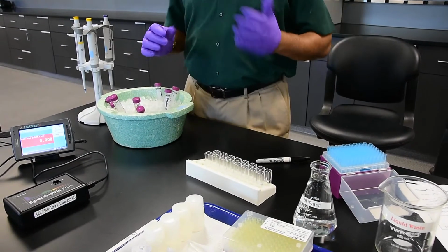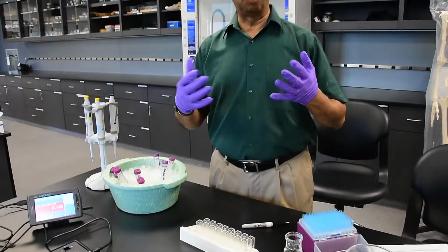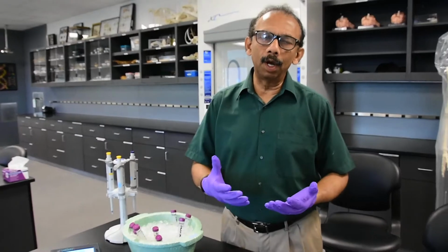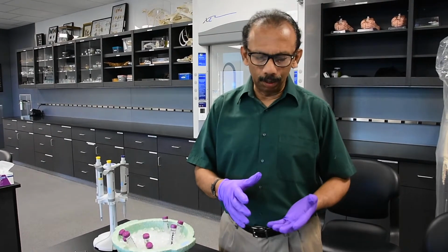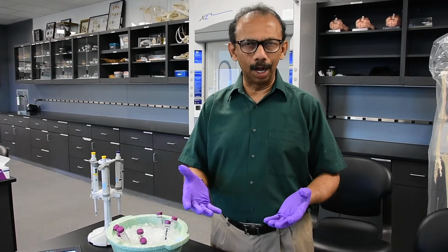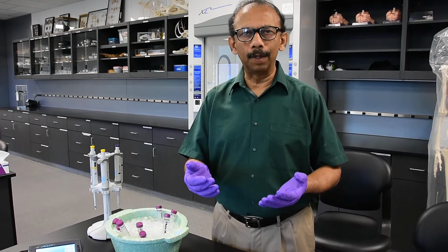To have this, you can use the formula (V1 + V2) / V1 = DF, and then figure out what that V1 is, and then you already know the V2, which is 1 ml. So in this case, it's a 2-fold dilution. You mix 1 part of the stock with 1 part of the water.